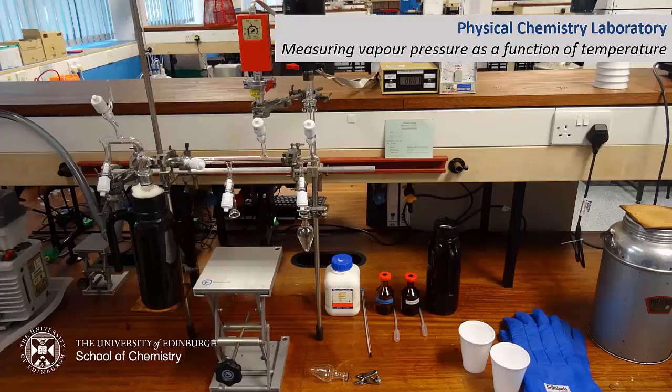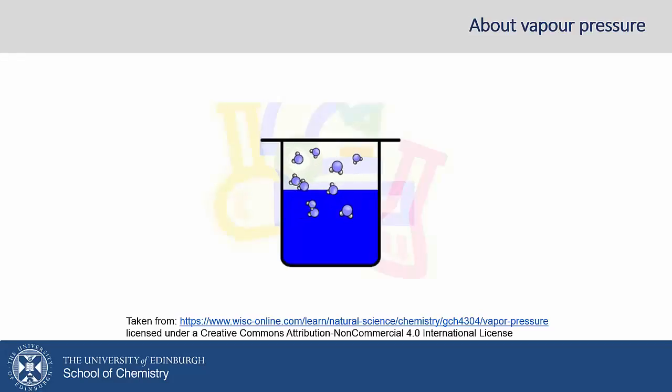This experiment focuses on learning how to use the vacuum line. To do this, we look at one particularly useful application, the measurement of vapour pressure. All substances have a vapour pressure. It is a property of the substance that quantifies the extent to which a substance is in equilibrium with its vapour phase. The higher the vapour pressure, the more volatile a substance is.